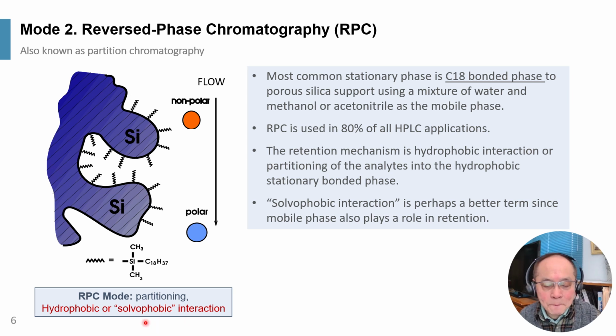Perhaps solvophobic interaction is a better term, since the analyte is actually interacting with mobile phase molecules, such as water by hydrogen bonding, acetonitrile or methanol through different types of solvent and analyte interaction.